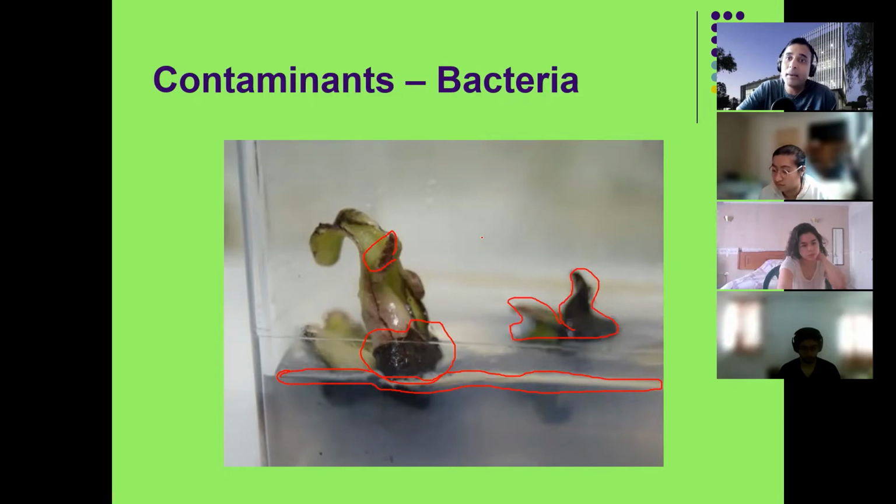If it is fungi, worse, because fungi is very dangerous. It creates spores, and when it creates spores and you mistakenly open the flask inside the incubation room, what will happen? The spores will spread everywhere in the air, and you won't even see them. Whenever you open it, whenever you have the airflow, they will move all around the lab, and they will keep contaminating for a long period of time. So you will never stop the contamination. Are you getting my point? How delicate and sensitive is working in a tissue culture lab?